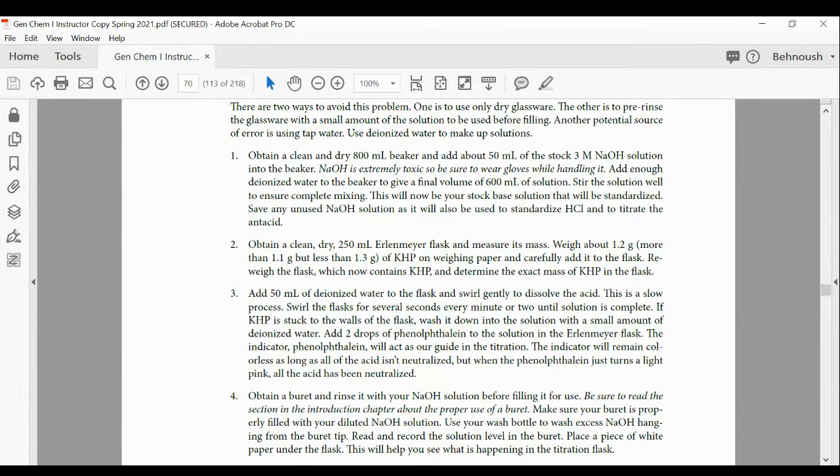The acid that you are using in back titration is going to be divided in two parts. Part of it would neutralize the antacid. Part of it is known as the leftover acid that you are titrating. But the total acid is consumed to neutralize the antacid, and also when you do titration, you find out how much is left over. So if you know the leftover and you know the total, the difference would be what was consumed by the antacid.